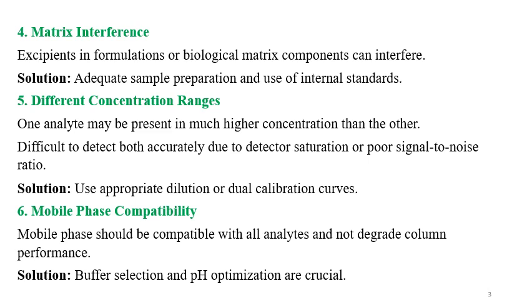You might have come across the formulations for antidiabetic range. So metformin is generally around 1000 mg, while the other component or other API in that fixed dose formulation may be 5 mg, 10 mg, 2.5 mg or 1 mg. So this difference in the concentration range is the problem.